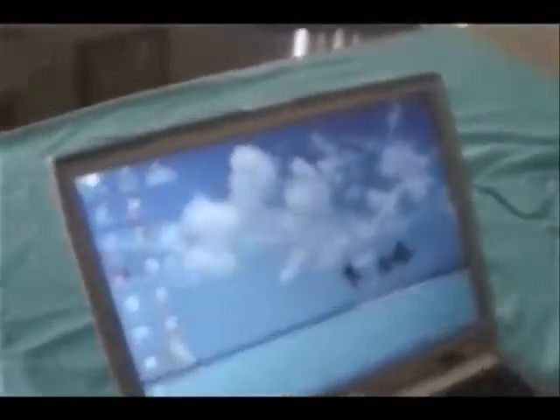Now, we're going to go to the computer and see how we can transfer the images from the LCD monitor over to the computer. It's simply done. First, we go here to video and what you're seeing here is actually a live image and I'll show you that it's a live image. You can see it move as I'm adjusting the microscope here on this side of the adjustment.